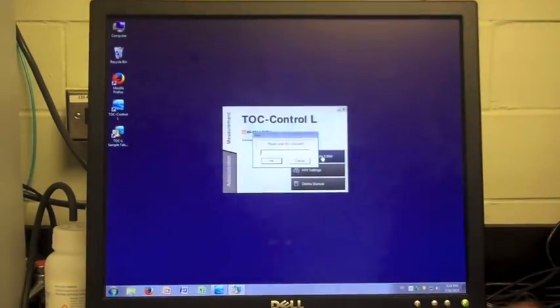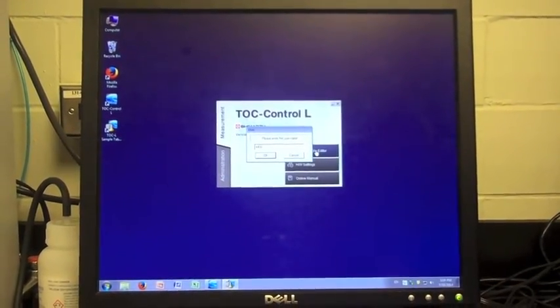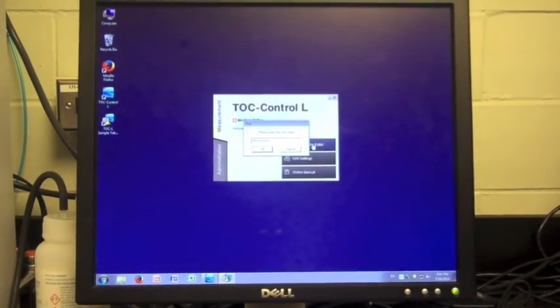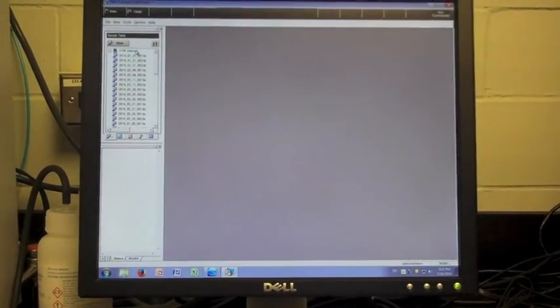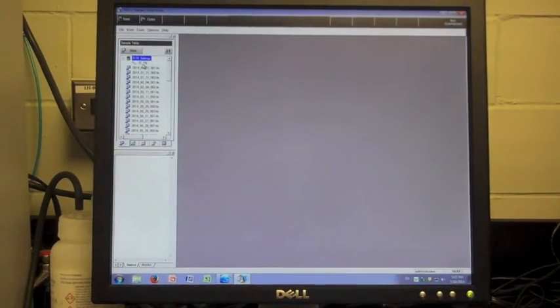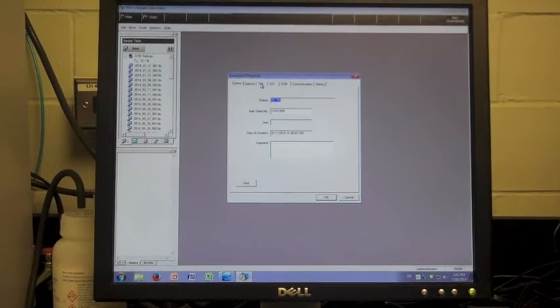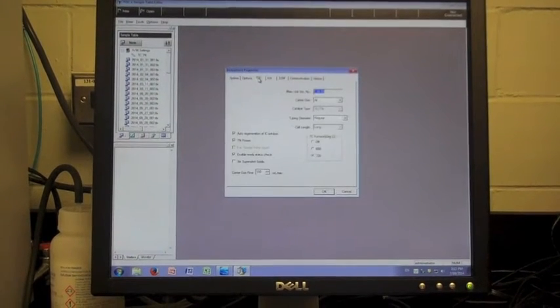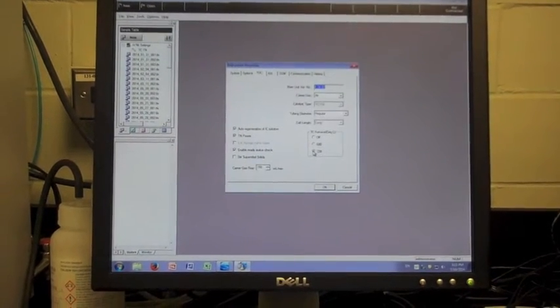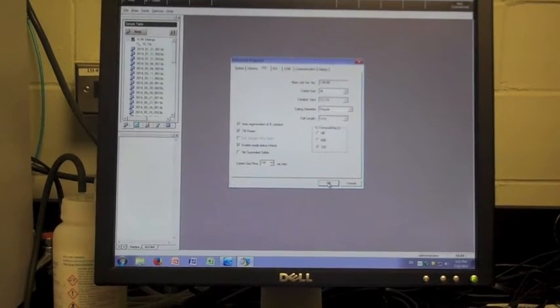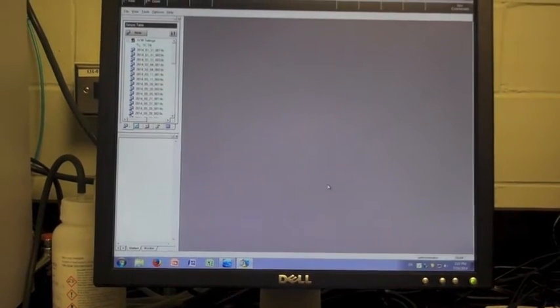In order to open the TOCL program, one must select the TOCL control icon on the home screen. This will offer a few options; the sample table editor should be selected. Once you have the window open, right click on the HW setting selection on the left side of the window to look at the instrument options. In the instrument section, check the TOC and make sure the furnace is turned on to 720 degrees Celsius. It will take the machine a few minutes to warm up.